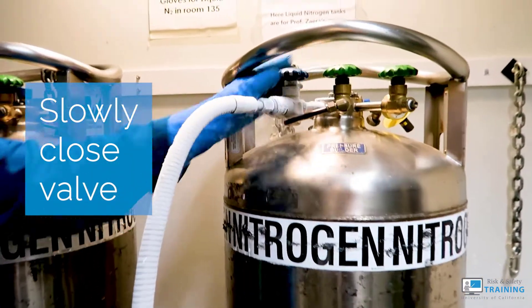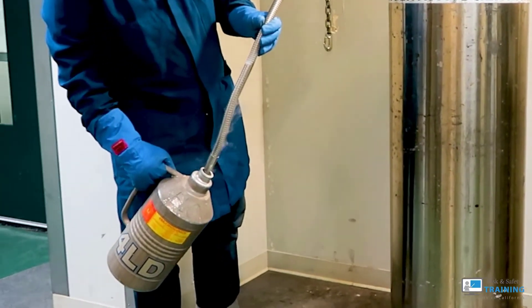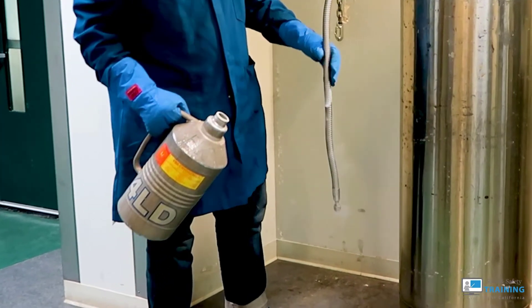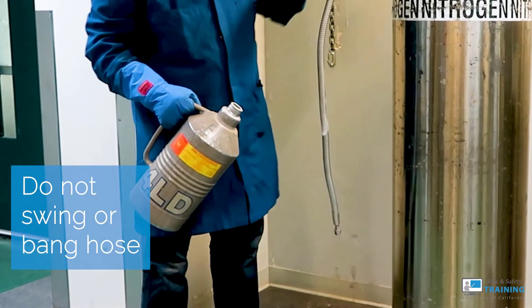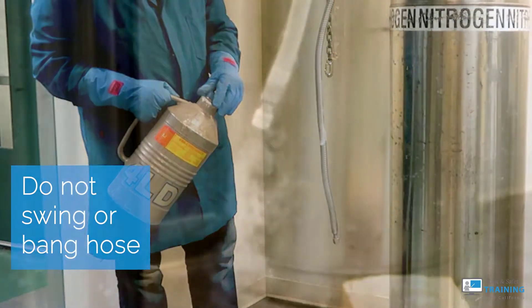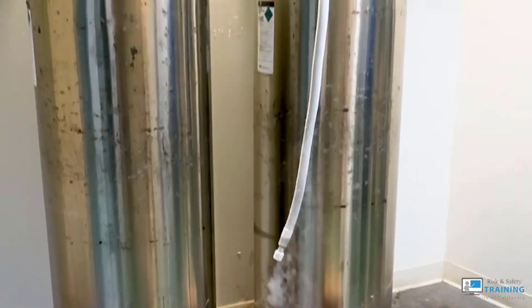Slowly close the valve when the liquid reaches its level. Wait until all liquid has exited before removing the transfer hose. Make sure not to swing or bang the line onto the cylinder or floor. The transfer hose will continue to exude gas until it's bled out.